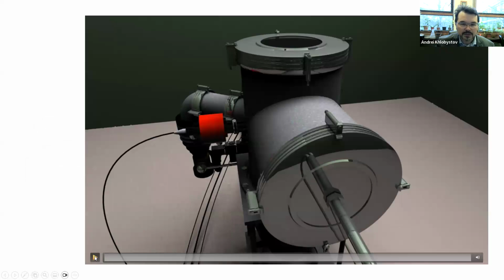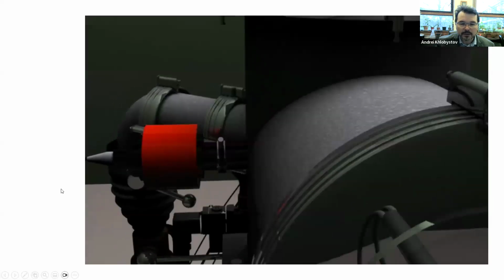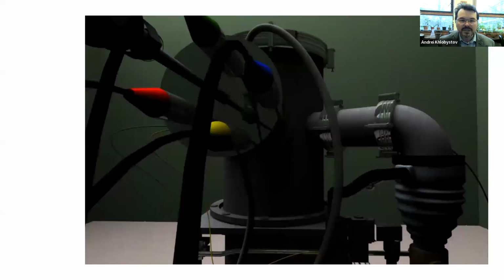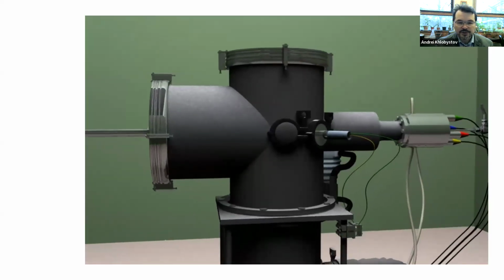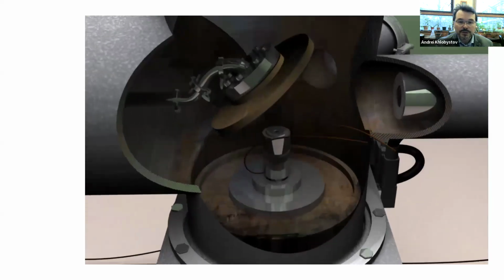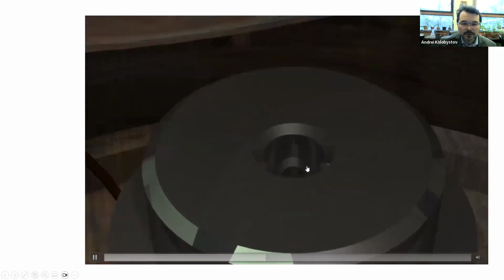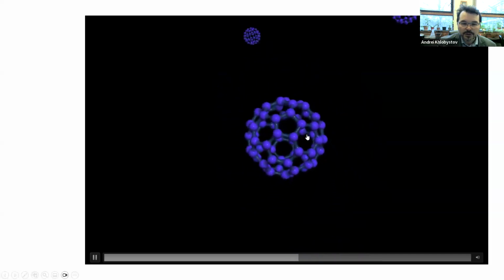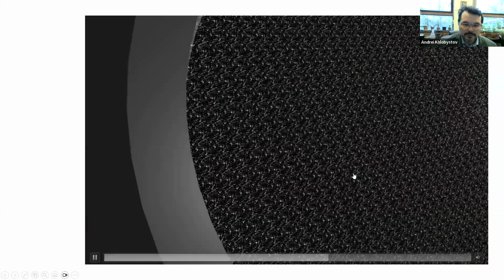So there are different methods how to make this so-called endohedral fullerenes. So we can use something called molecular surgery, where we chemically open the hole in the fullerene and then put something inside, followed by stitching the fullerene again, chemically, of course. There is electric arc discharge, which is quite useful for putting metals into the fullerenes. Or there is something called ion beam implantation. That's the method that I'm showing here. So we have a crucible in a vacuum, which vaporizes fullerenes. And as they fly through the vacuum chamber, we fire, in this particular case, nitrogen atoms, ions.